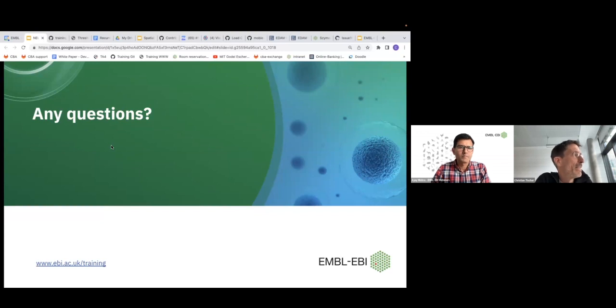So we have mainly started from fluorescence microscopy images, and there you just acquire 1 or 2 channels, right? And you treat them as grayscale. But with, for example, medical, if you think about histology, then you have these color cameras. And that's a whole different topic, like how the color comes in from these stains and so on. So this is something we are missing right now because we didn't think about it. That would be one example where there's right now a teaching module missing that specifically deals with RGB type images. Yeah, so that's maybe one answer. I hope that's good. Thanks.